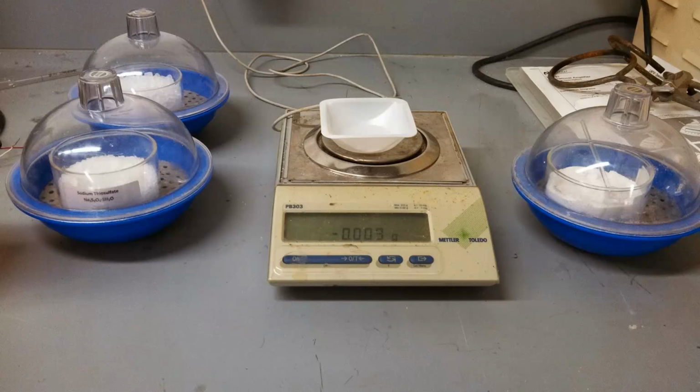To make your titrant, you're going to use a different kind of balance this week. This is a top-loading pan balance. The reason we use it is because it has a much higher capacity, and we don't actually need the precision that we get from an analytical balance to make this titrant solution. So you're going to weigh out a little less than 9 grams of your sodium thiosulfate. You're also going to add a little bit of sodium carbonate as a buffer.